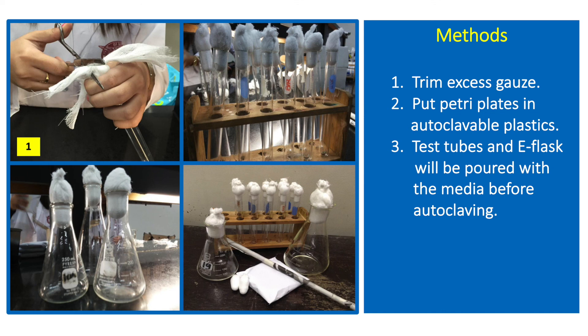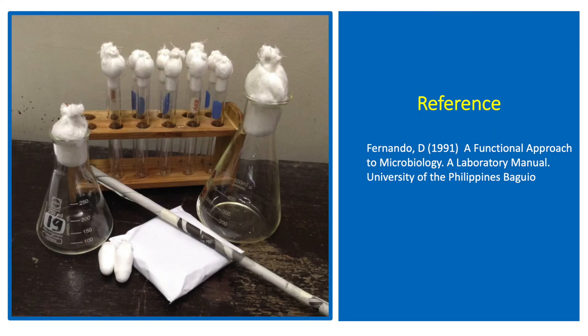Wrapped petri plates are put in an autoclavable plastic before sterilization.